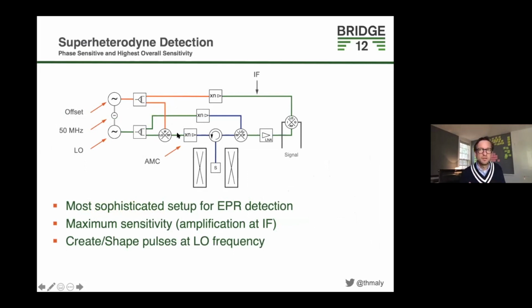So there's a lot of technology available, and you don't have to create the pulses at the high frequencies. In the future, I'm pretty sure with the availability of digitizers that operate at higher and higher frequencies, there's actually a way you could just sample at this frequency.